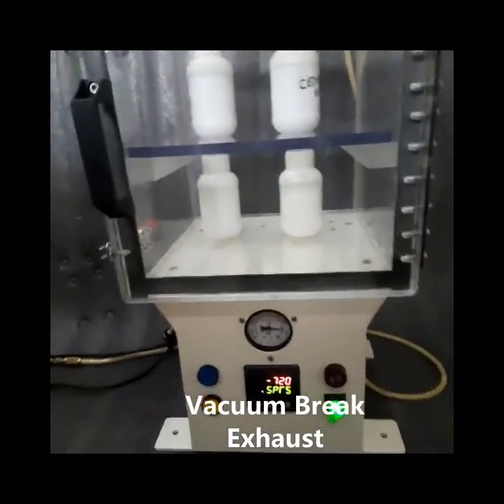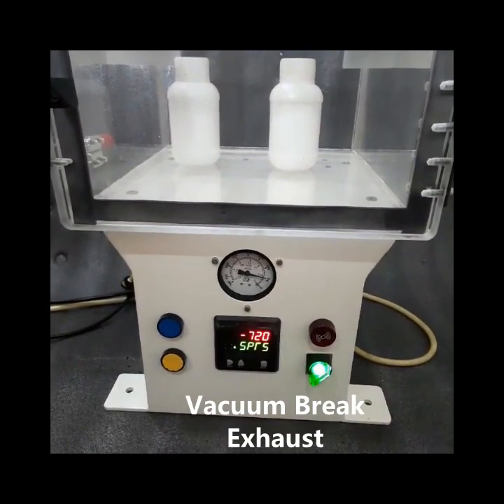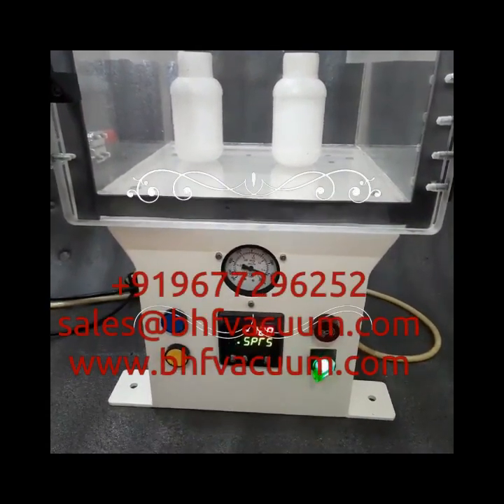The vacuum is broken inside the chamber. We can see that the needle is coming down.